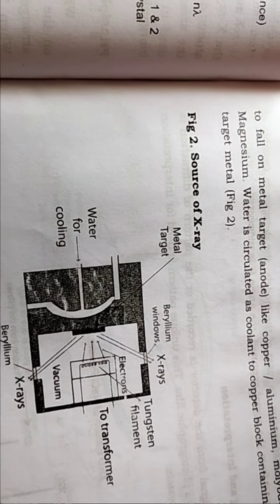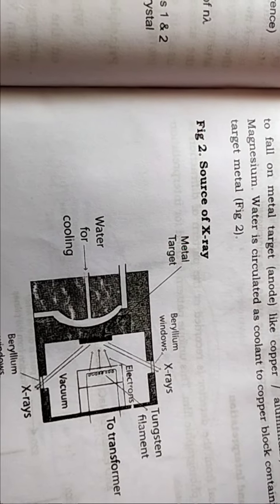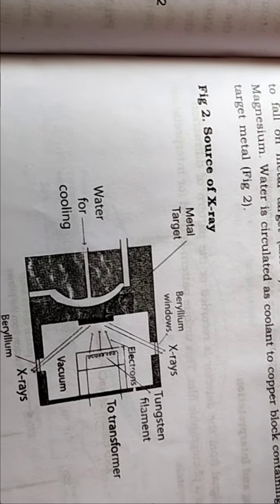to be presented in a sample film holder. In some XRD instruments, the sample holder is fixed while the source or detector is rotated, and in others the sample holder can be rotated while the X-ray source is in a fixed position.